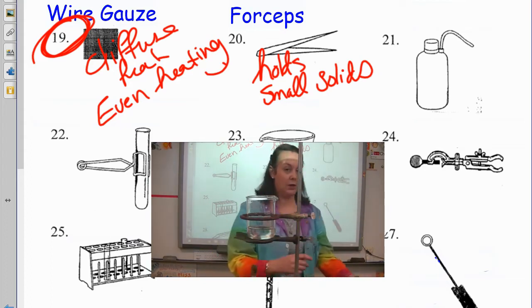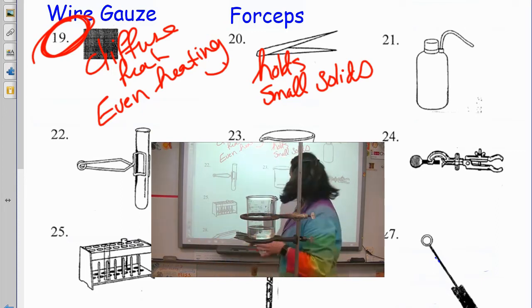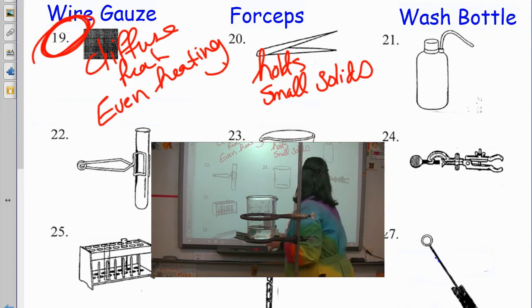Next, we have here where to go. This is called a wash bottle. Wash bottle. And this is for rinsing.